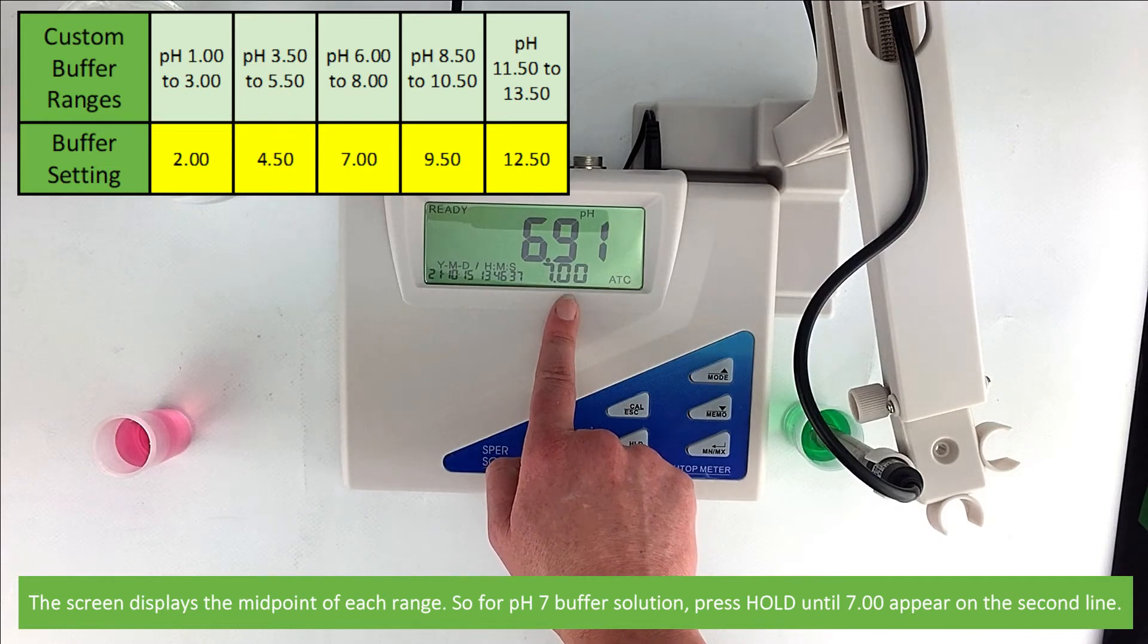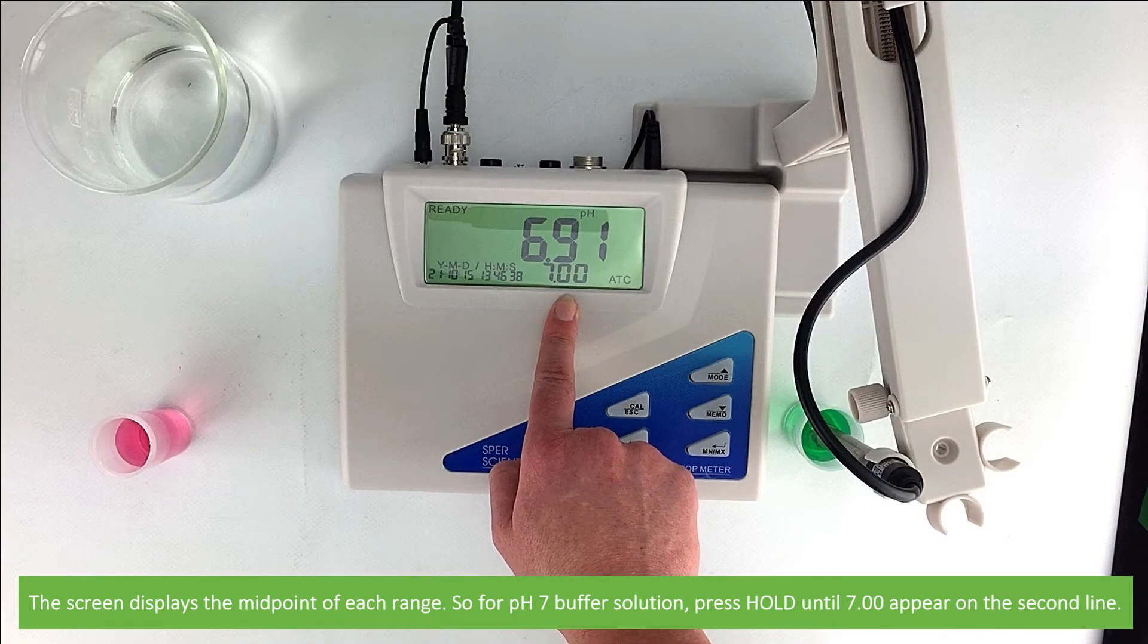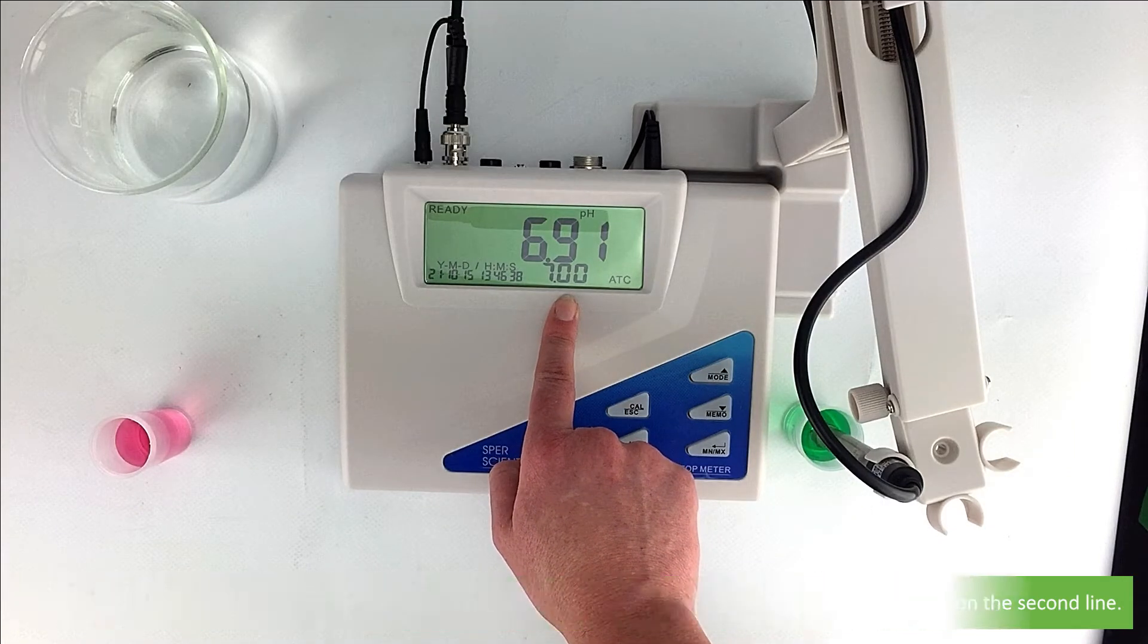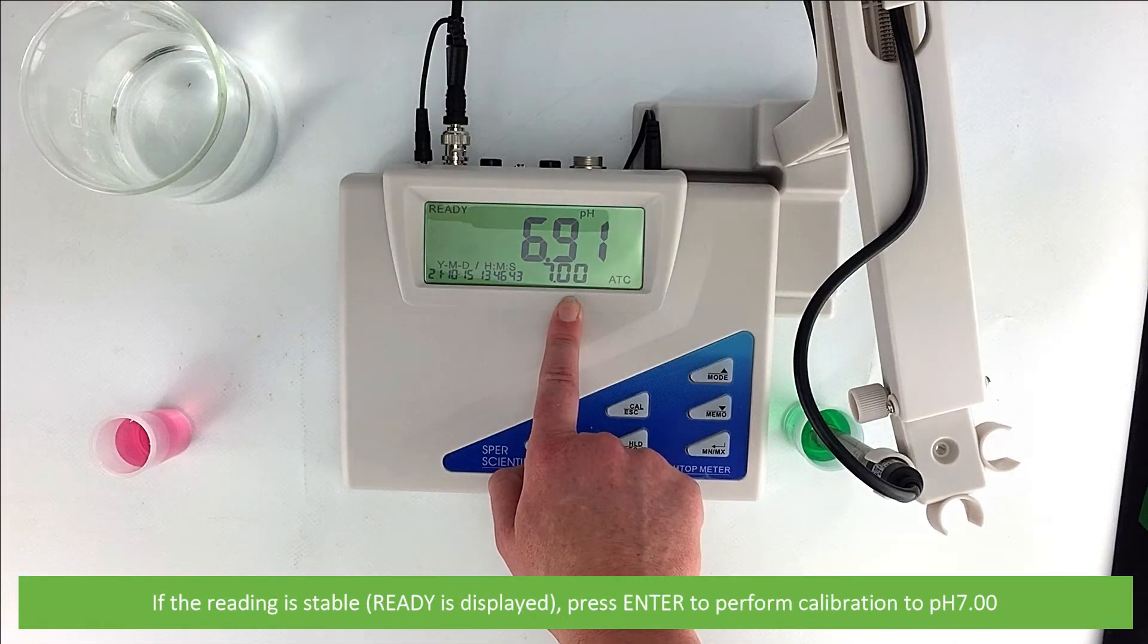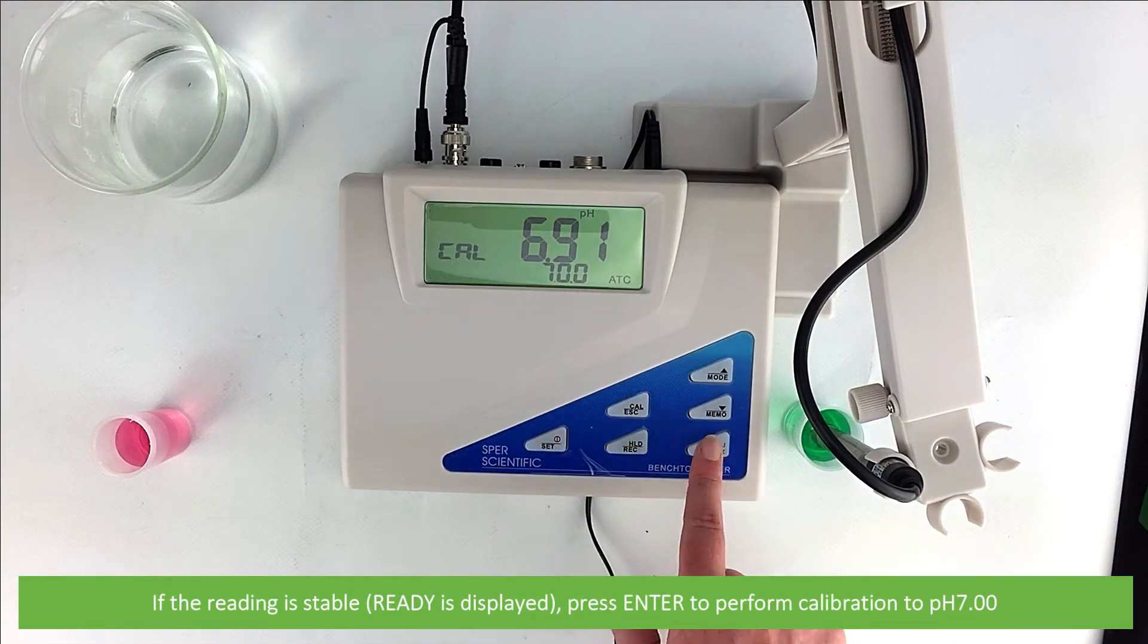So for pH 7 buffer solution, press hold until 7.00 appears on the second line. If the reading is stable and ready as displayed, press enter to perform calibration to pH 7. The screen will blink as calibration is occurring.